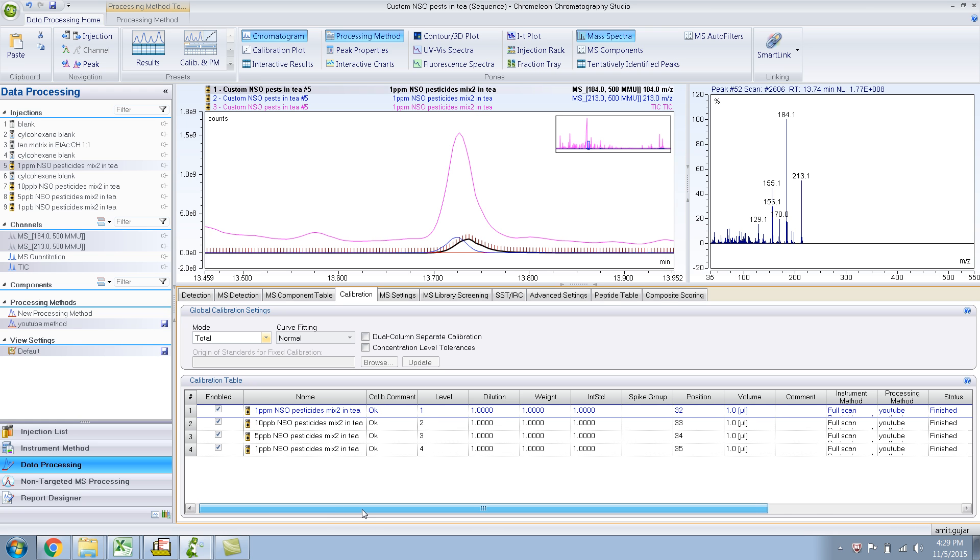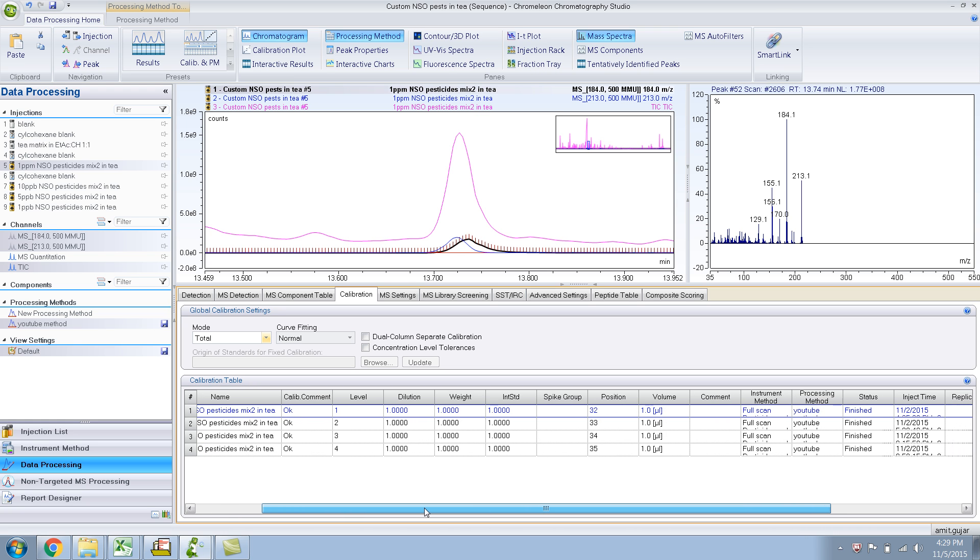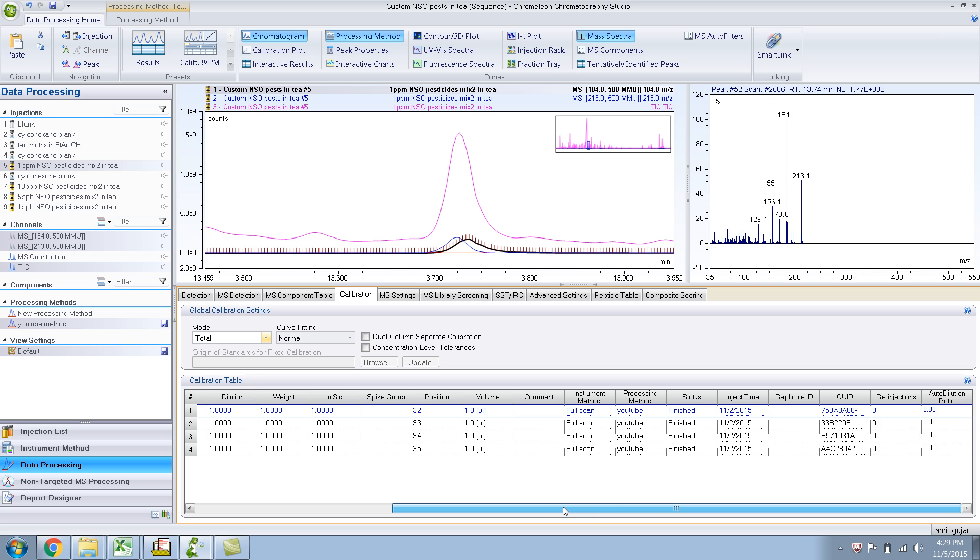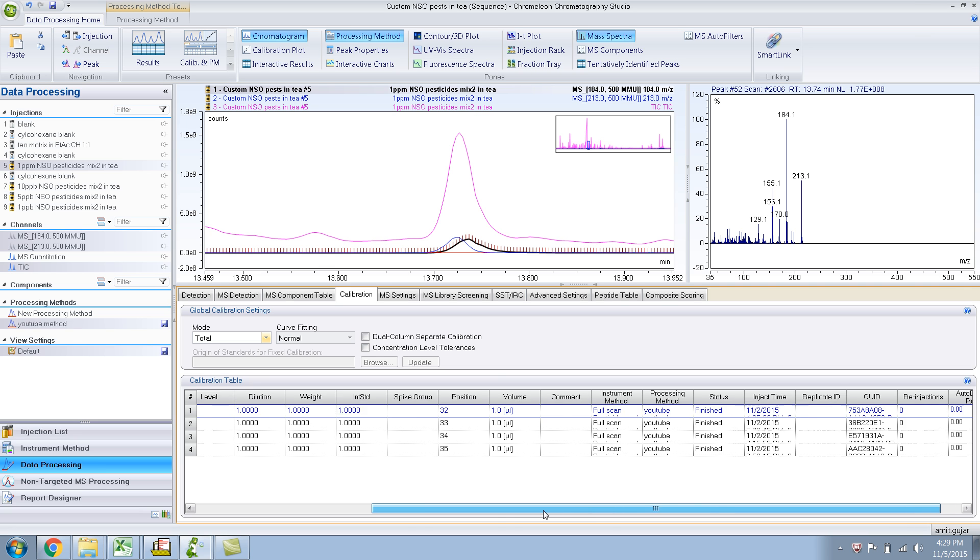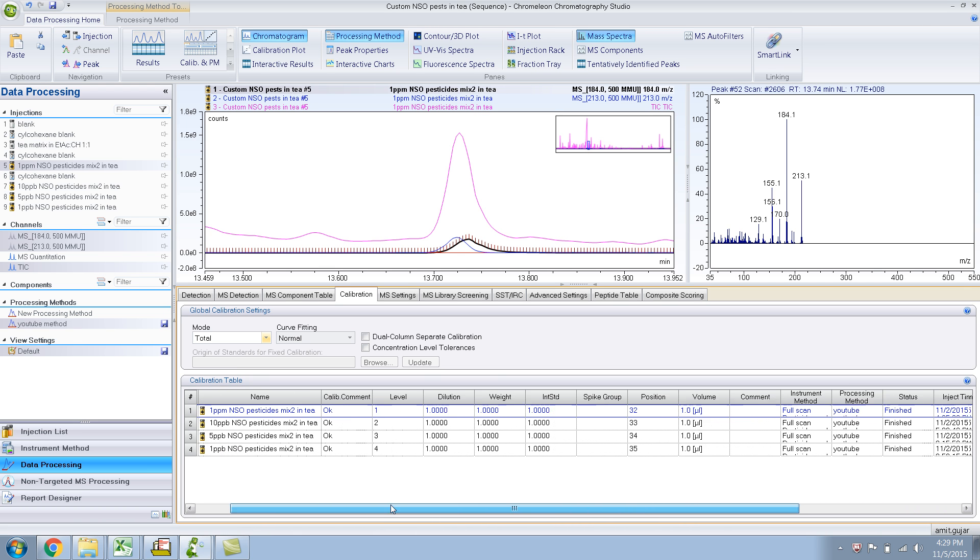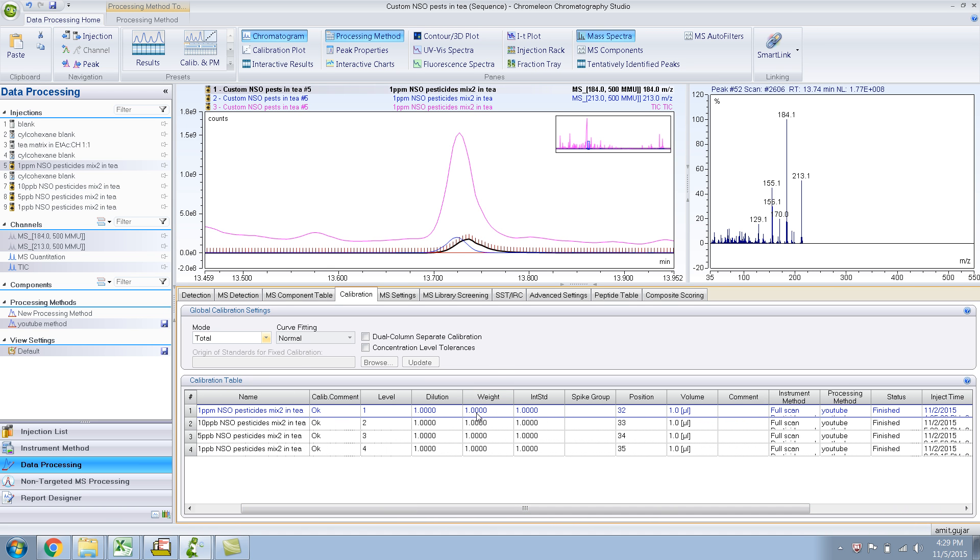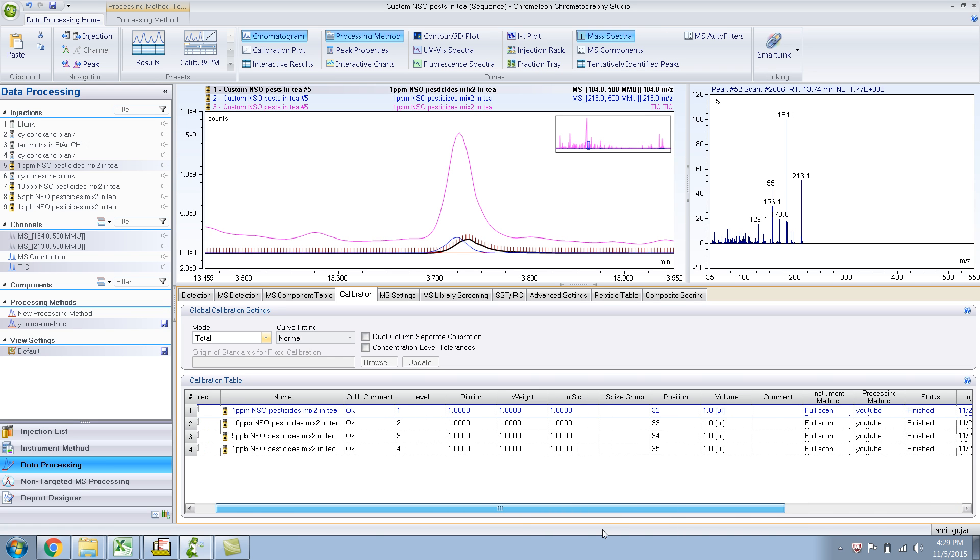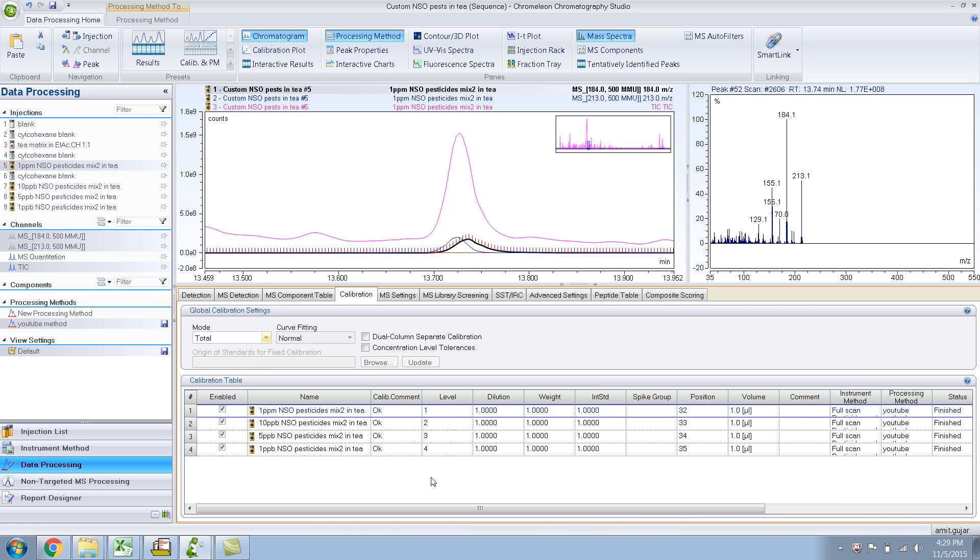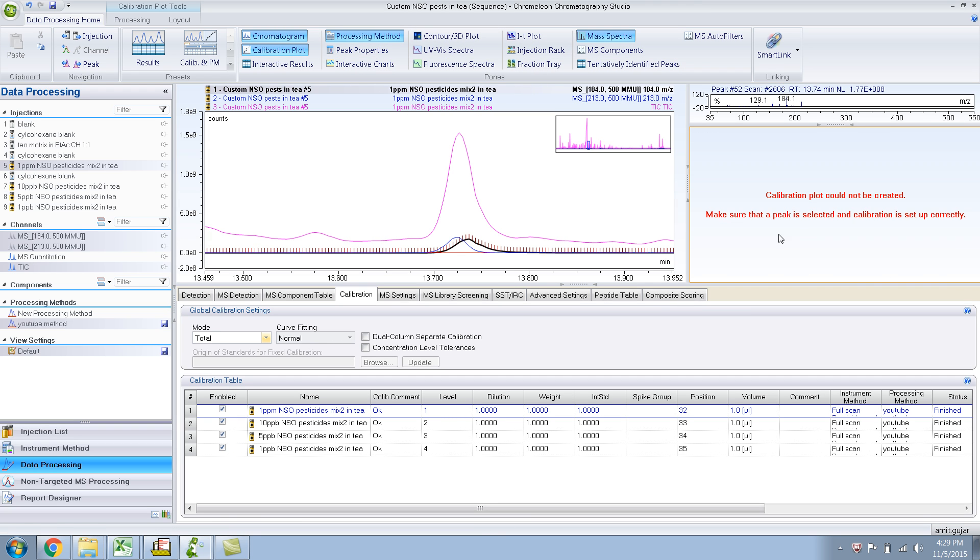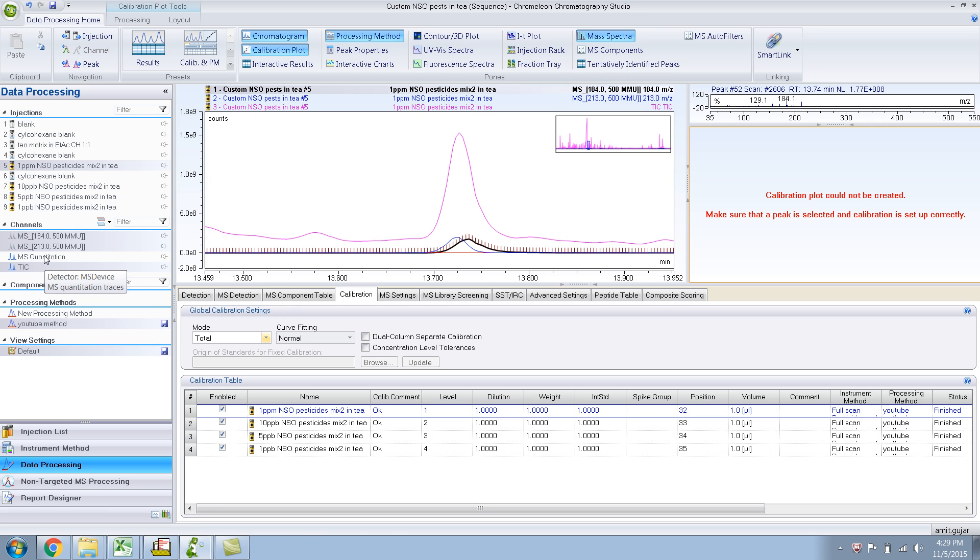The table itself, I don't think it's editable. The curve fitting. What is curve fitting? Let me bring up the calibration plot. Make sure the peak is selected.